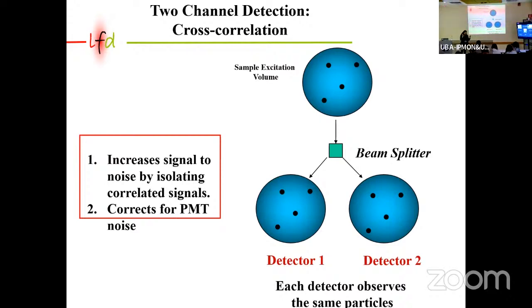A lot of biologists come to me and say, oh, but I can do colocalization. I can see if those two molecules are colocalized in a pixel. And I say, great. Let's take the situation: I have two molecules in the same pixel, but how do I know they're bound? They say, oh, but they're in the same pixel. Like, yeah, I'm sitting in a room, my colleague's there, we're in the same room, but that's it, right? How do we know that these two molecules are not just holding hands, walking around together?